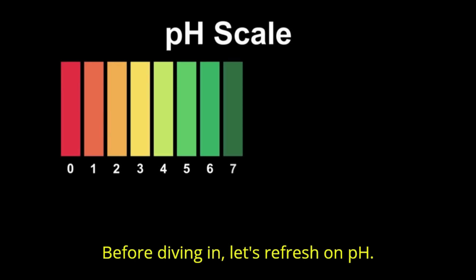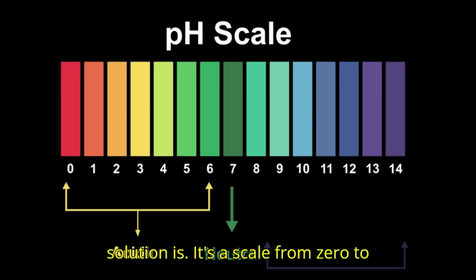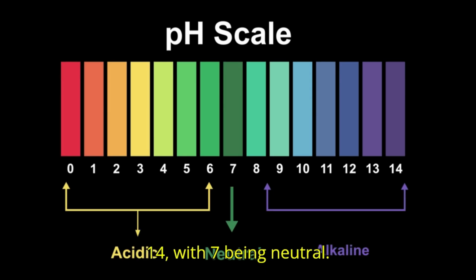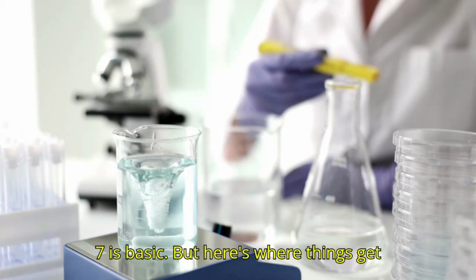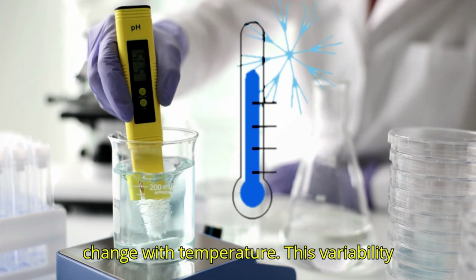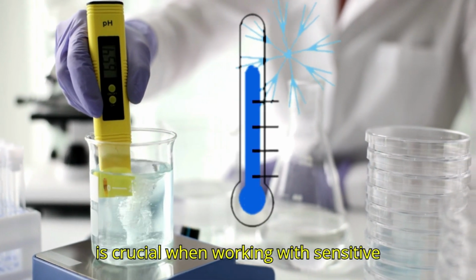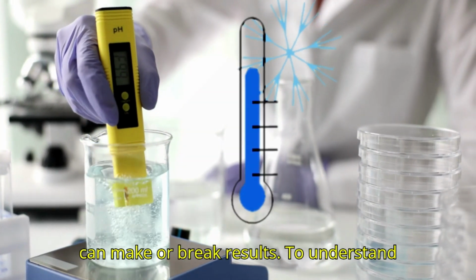Before diving in, let's refresh on pH. pH measures how acidic or basic a solution is. It's a scale from 0 to 14, with 7 being neutral. Anything below 7 is acidic, and above 7 is basic. But here's where things get interesting. pH isn't constant, it can change with temperature. This variability is crucial when working with sensitive experiments, where precise measurements can make or break results.